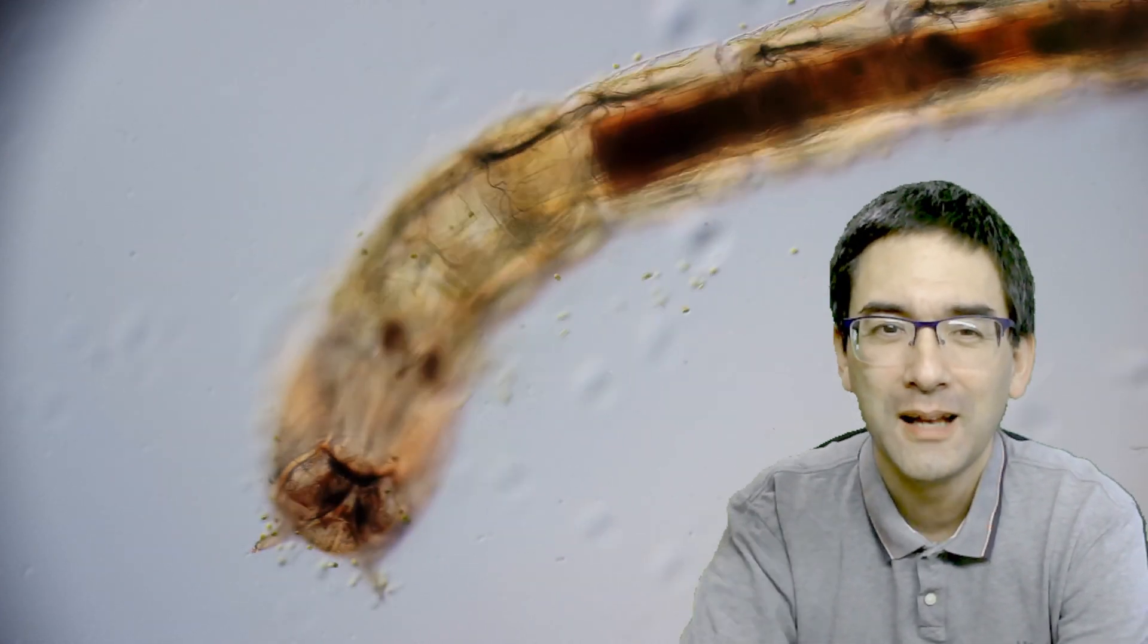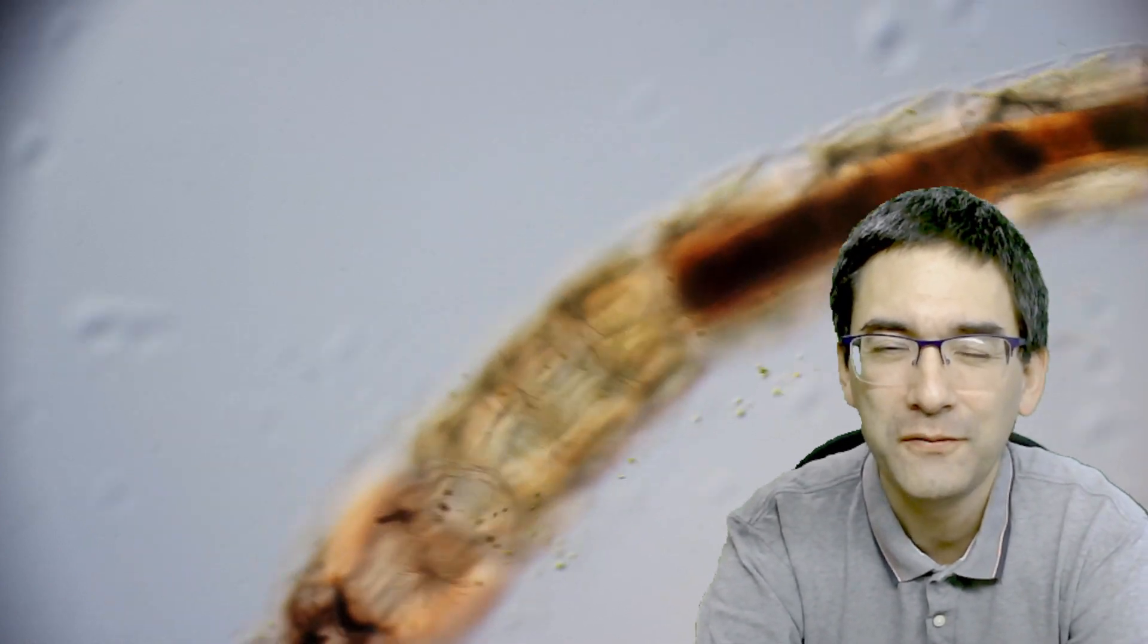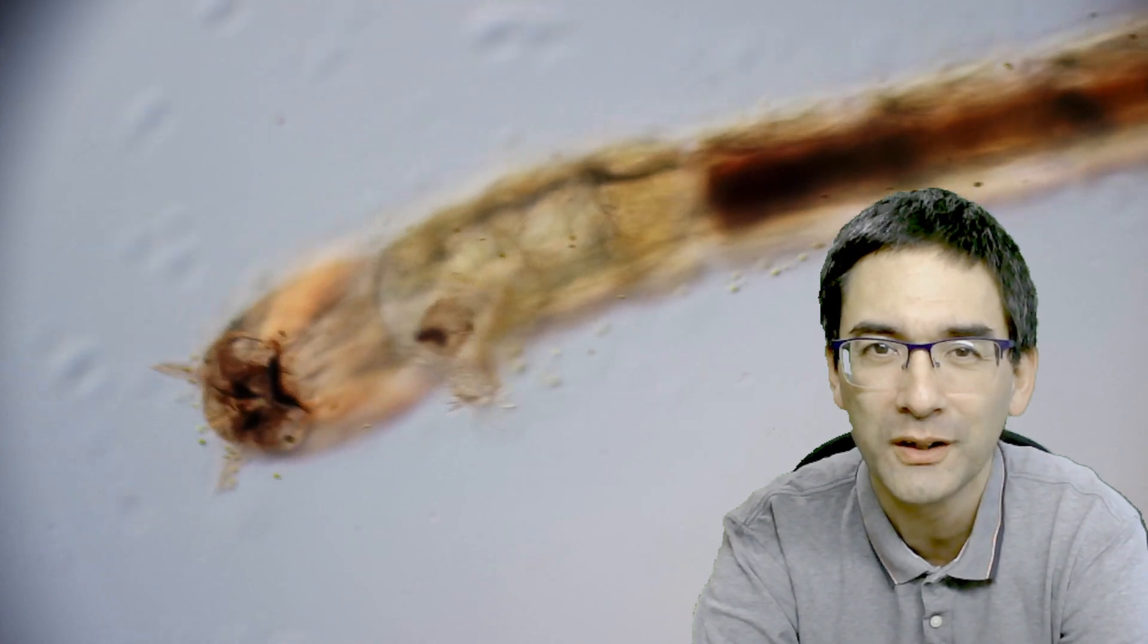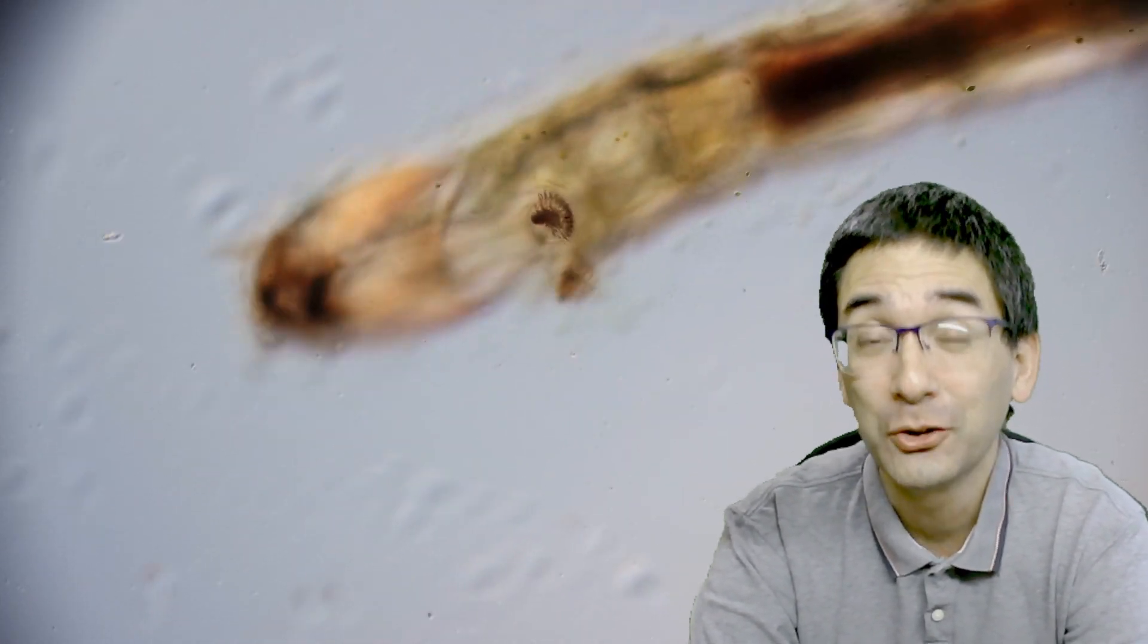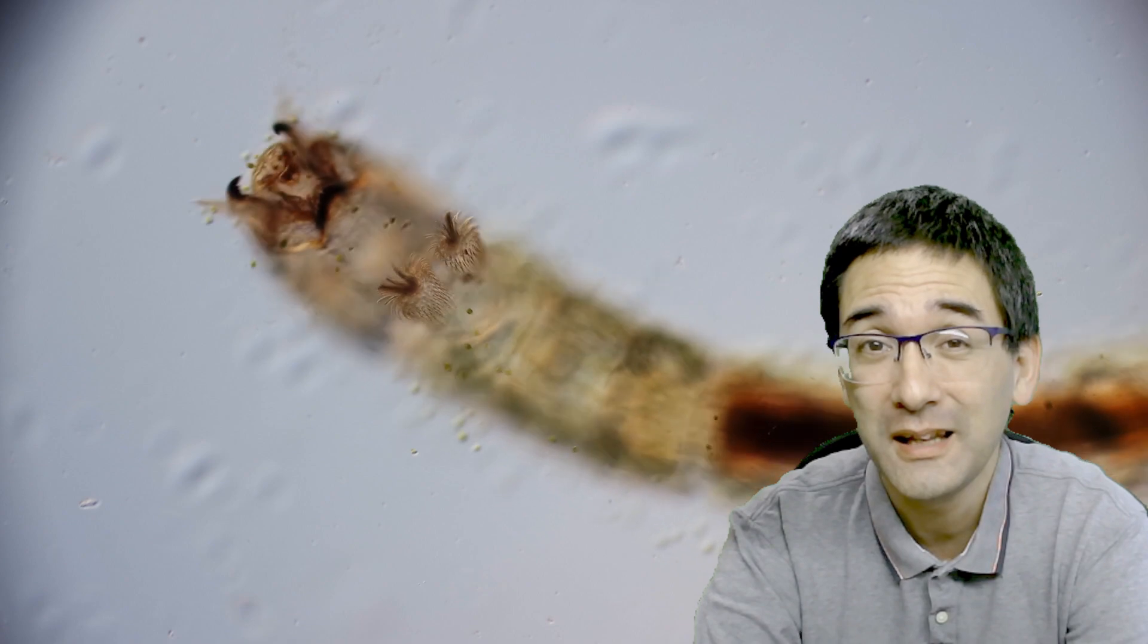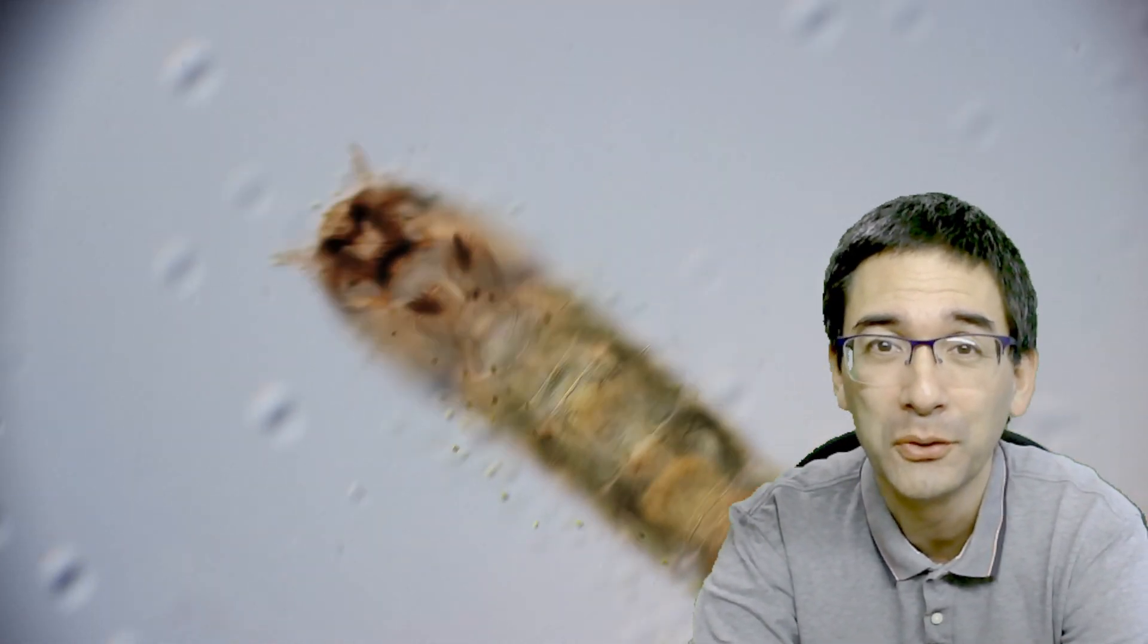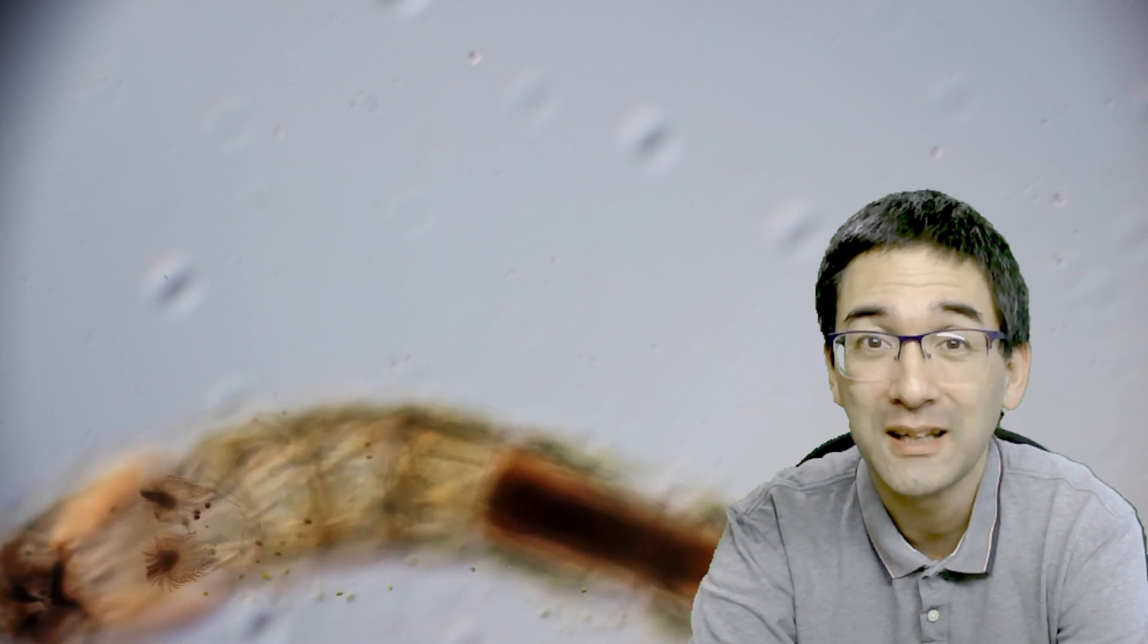Now I was wondering, how is this possible that those feet are able to form such a good grip on the smooth glass slide? Because after all, tardigrades basically have a big problem moving along. They slip quite a lot and stay put on one place on the slide because they can't move forward.